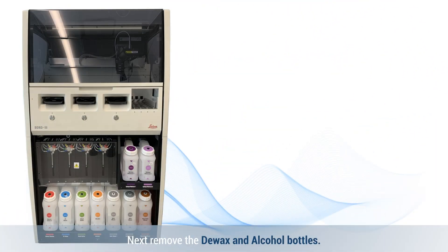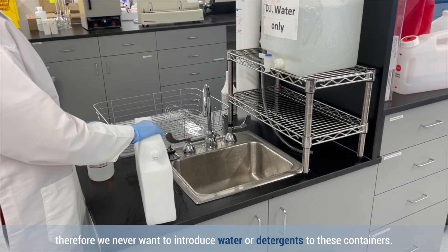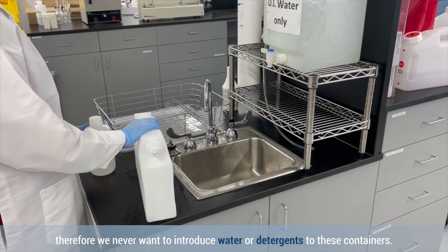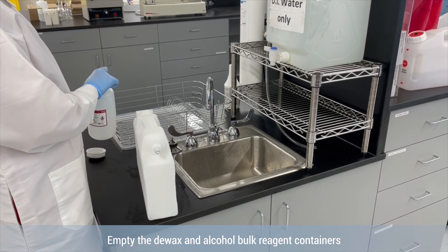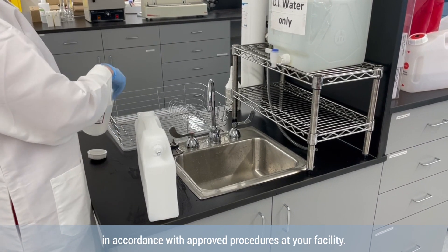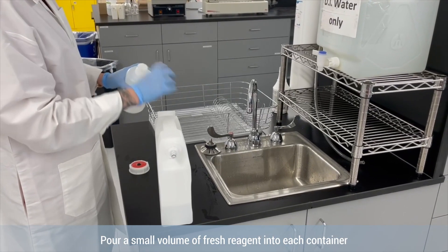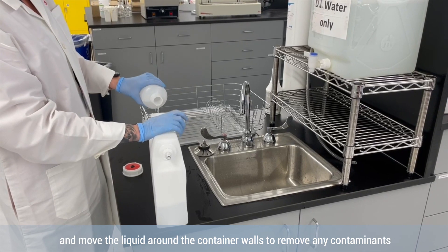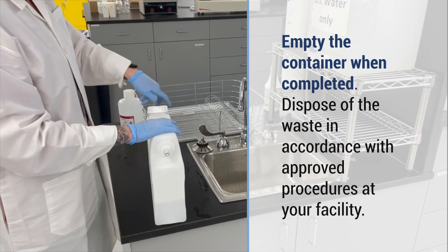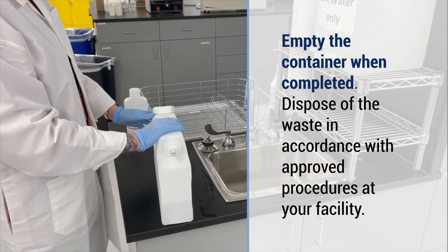Next, remove the de-wax and alcohol bottles. De-wax and alcohol are non-aqueous solutions. Therefore, we never want to introduce water or detergents to these containers. Empty the de-wax and alcohol bulk reagent containers in accordance with approved procedures at your facility. Pour a small volume of fresh reagent into each container and move the liquid around the container walls to remove any contaminants from the bottle. Empty the container when completed. Dispose of the waste in accordance with approved procedures at your facility.